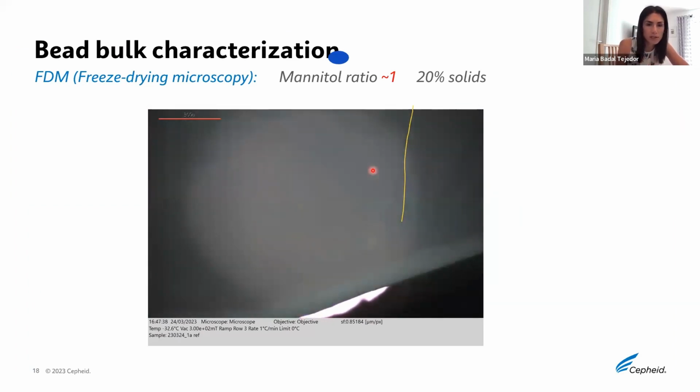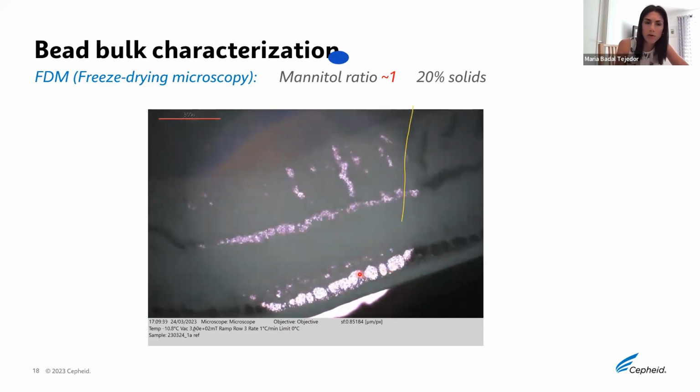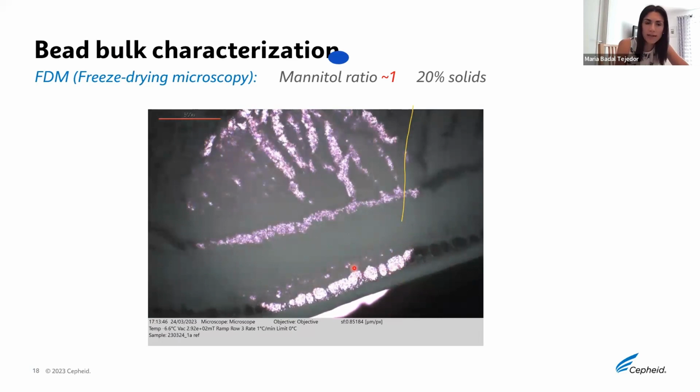We see first in opaque color how the solution is frozen, and then as we start heating up the solution, we see in a gray opaque how it dries first, it collapses, and afterwards it becomes transparent. Then we see how the solution becomes opaque again with a gray color, which means that we face a kind of restructuring and recrystallization of the solution, having a second drying front that will fully collapse later on.